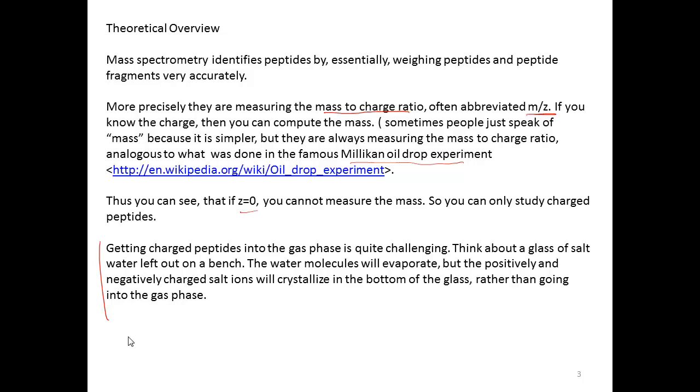So let's think about measuring the mass of a charged particle. I want you to think about these large circular atom smashers, in which you have atoms or other charged subatomic species traveling around at speeds close to the speed of light, and they are all charged, and there are magnetic and electric forces that are going to cause the beams to bend inwards. And for a certain mass traveling at a certain speed, there'll be a certain amount of force that's required at all places in this circle to have a stable orbit.